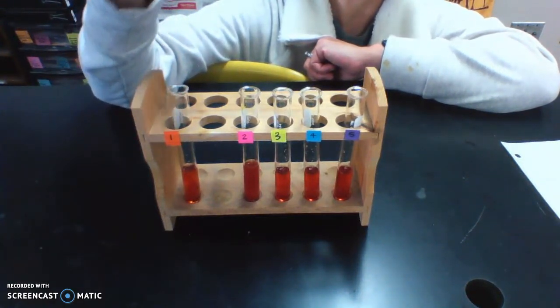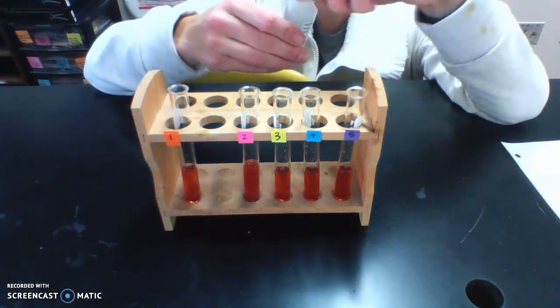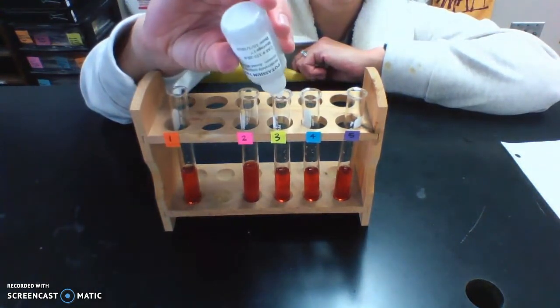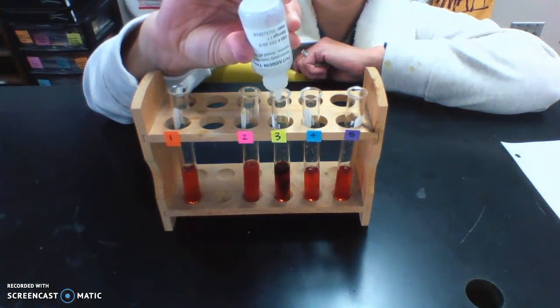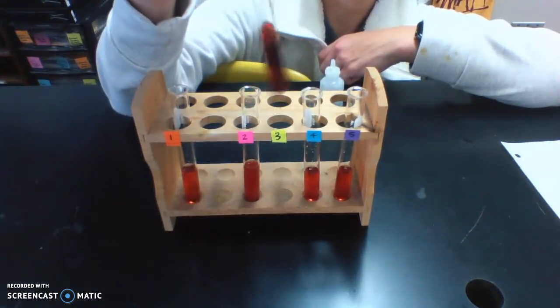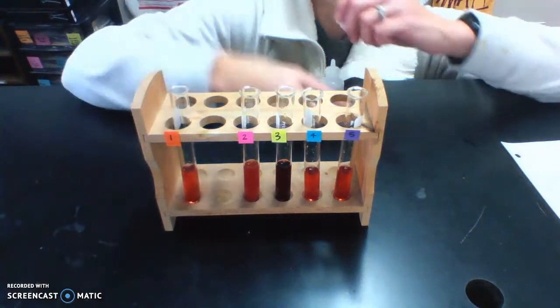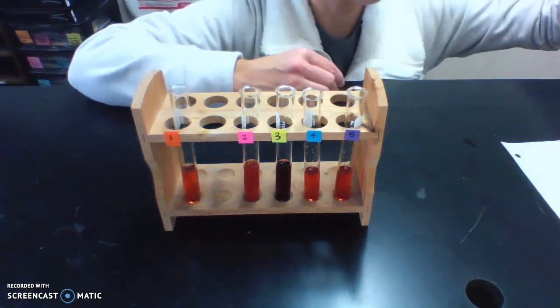Let's add to tube 3 more KSCN, the thiocyanate ion. You can see this one gets darker red. Still looks like it's on that red side, okay? All right, so it's shifted the same way.